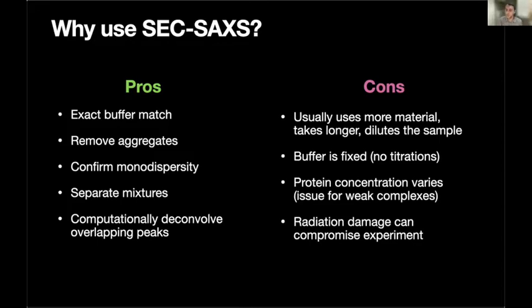I think Richard showed you an example of a structure factor, so interparticle interference. So if you have some sort of concentration-dependent protein-protein interaction, that might show up because you have this change in concentration. And then finally, you're flowing, you've got the X-ray on continuously, you're really cooking the sample, and so sometimes radiation damage can be a problem.